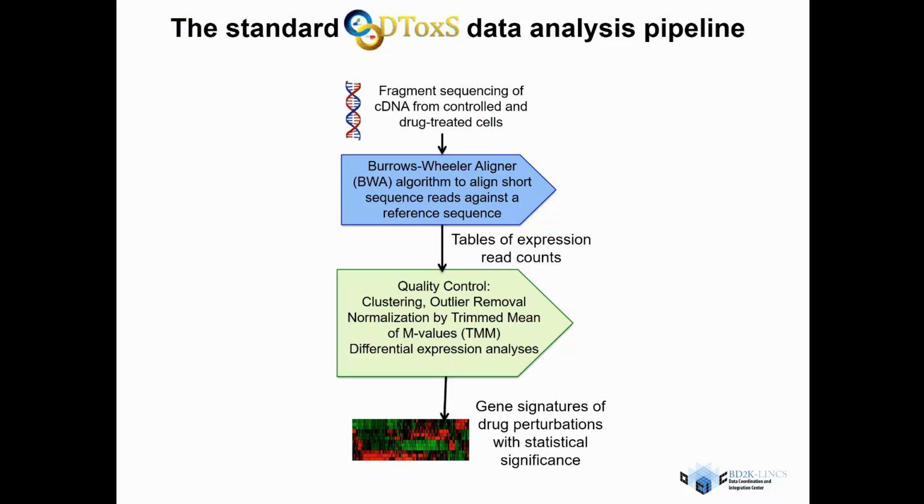And then we also have these as paired ends. One file contains the unique molecular identifiers, UMIs, the tags, barcodes, and the other file actually contains the sequence. So the first script goes through and takes the unique identifier, attaches it to the title line so that we can keep track of the UMI as we go through the processing.